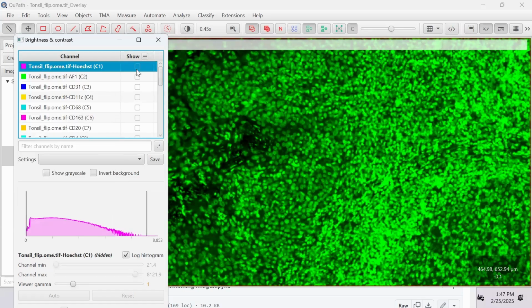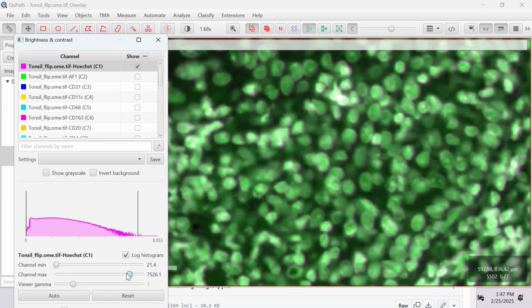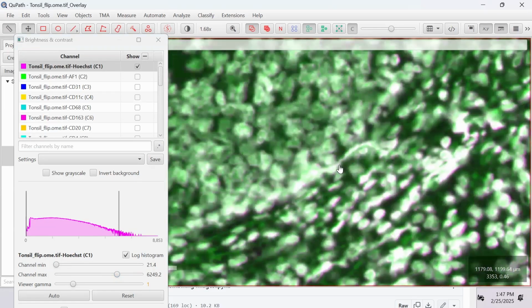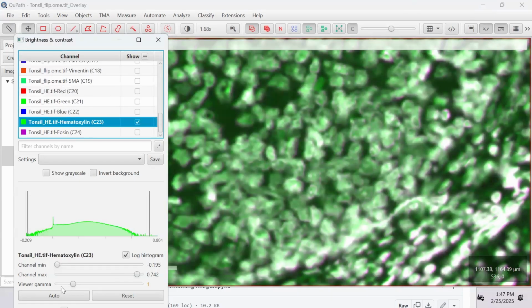And I'm going to flip this to magenta. And now I might need to play a little bit with those settings, in order to create a better visual overlap. But pixels that are strongly overlapping in those two channels, they should give me white image.